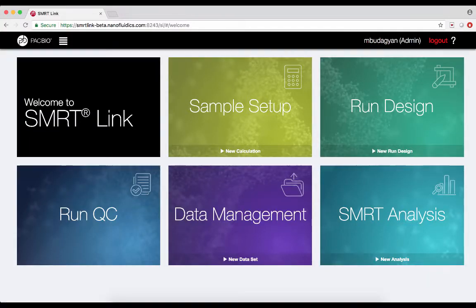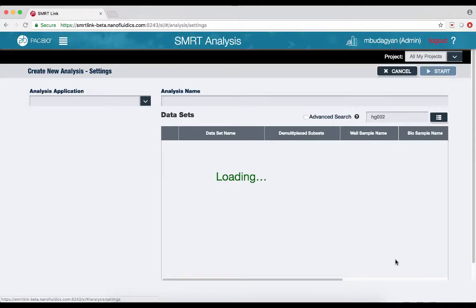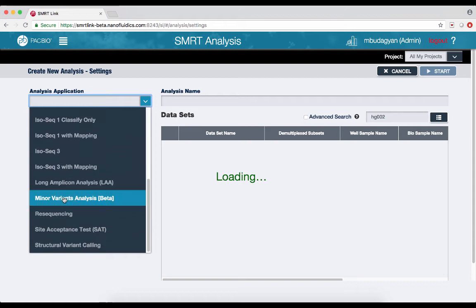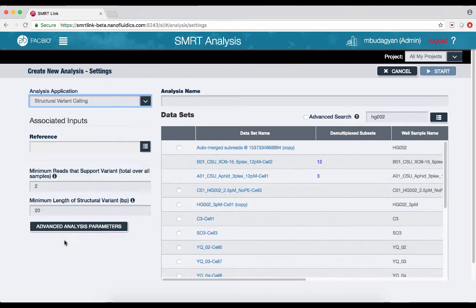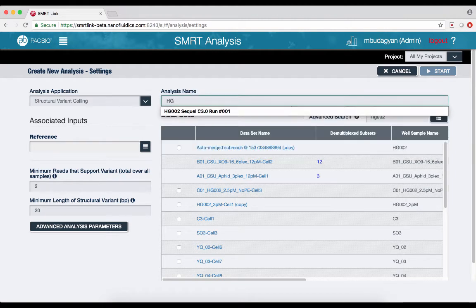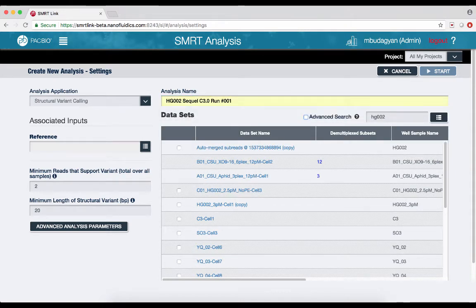To launch the Structural Variant Calling application, create a new analysis in the Smart Analysis module of SmartLink. Select Structural Variant Calling from the Analysis Application drop-down, then name the analysis and select the desired dataset or datasets.